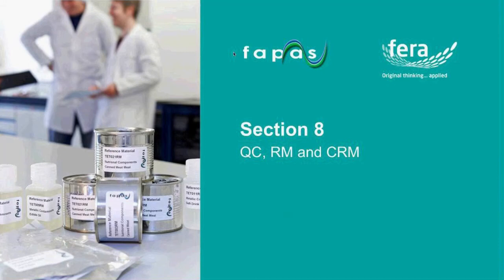Section 8. This is about after the proficiency test and the uses of samples that remain. So this is about the difference between a QC sample, a reference material, or indeed a certified reference material.